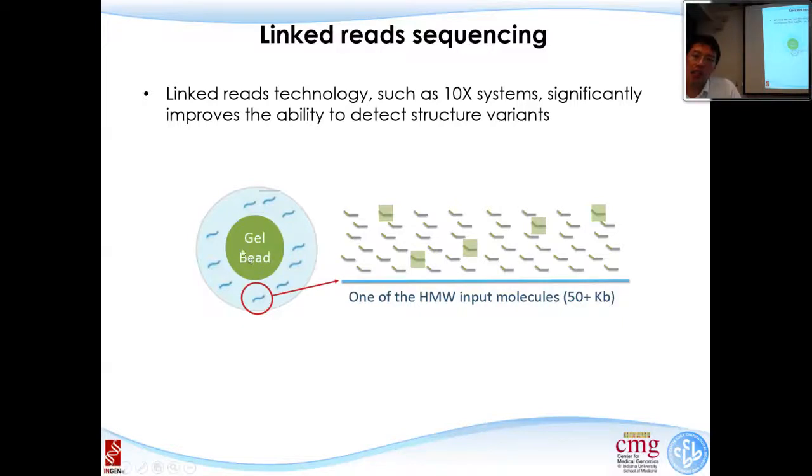This is one specific gel. In this gel, you will track about 10 molecules. Each one is about 50,000 bases, so it's very, very long. It's not 500 at all.